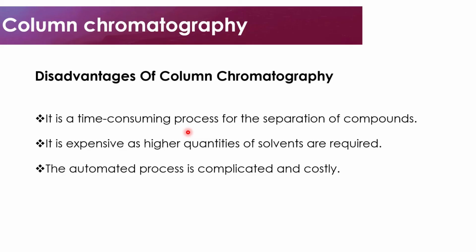As for the disadvantages, one, it's a time consuming process for the separation of compounds, and two, it's expensive as higher quantities of solvents are required, and the automated process is complicated and costly. So these are a few of the disadvantages of column chromatography.